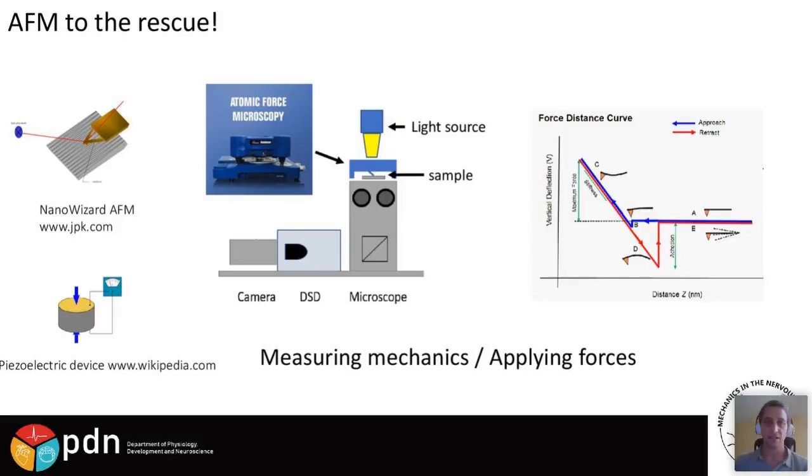They are very sensitive to imaging noise, and this is the reason why AFM, atomic force microscopy, that we saw earlier, is so appealing: it's a direct force measurement, and you can measure the adhesion, you can measure the topography, and it has a wide range of stiffness measurements. Modern AFMs can produce measurements of 500 by 500 pixels in timescales of minutes, which is also appealing for biological processes, which are not usually so fast.